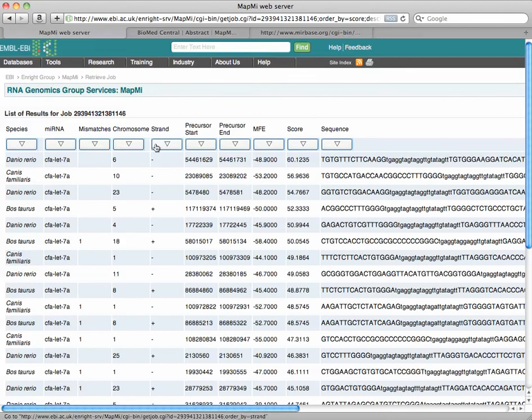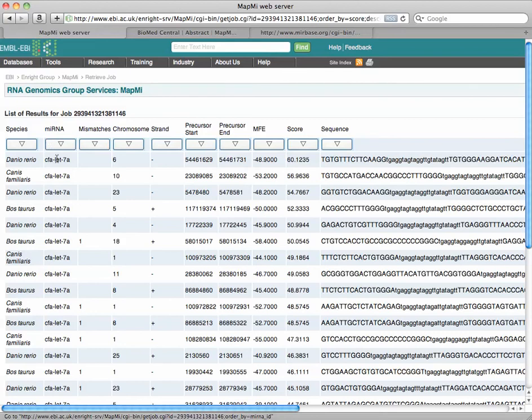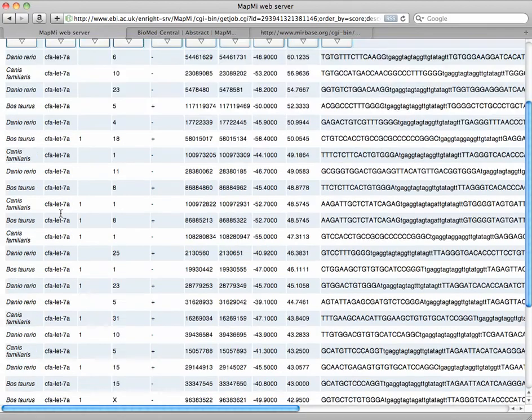On the precursor end and start locations, strand, the chromosome it's on, and the mRNA, the microRNA, as you see here. They're all related.